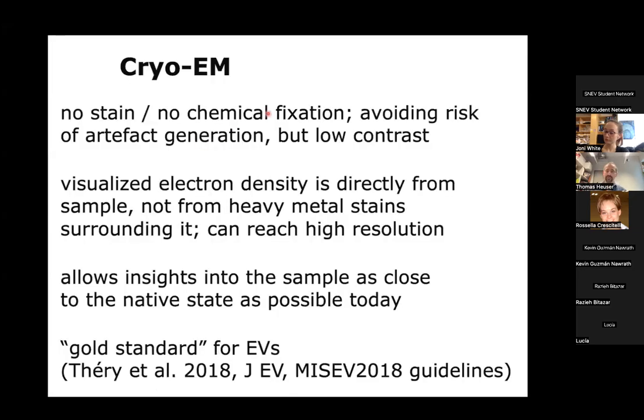So introducing cryo-EM. Since the 1980s, people found a very, very different way of doing EM. And in 2016, this method was also honored with the Chemistry Nobel Prize. So how does it work?